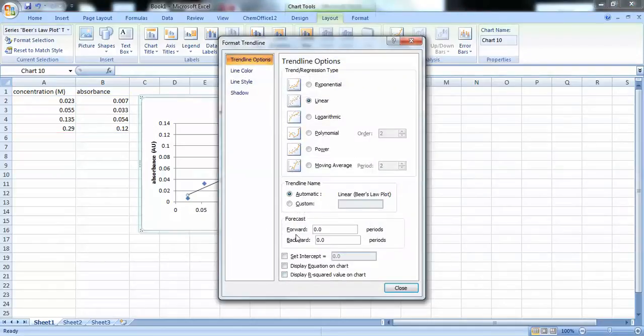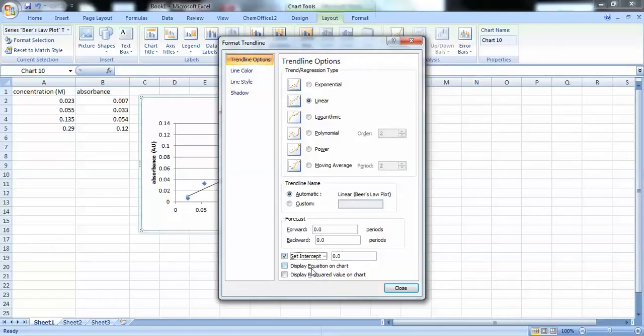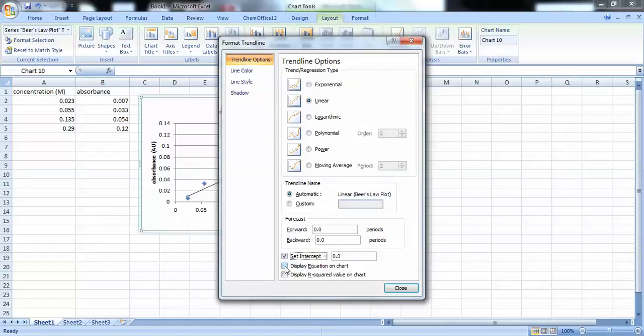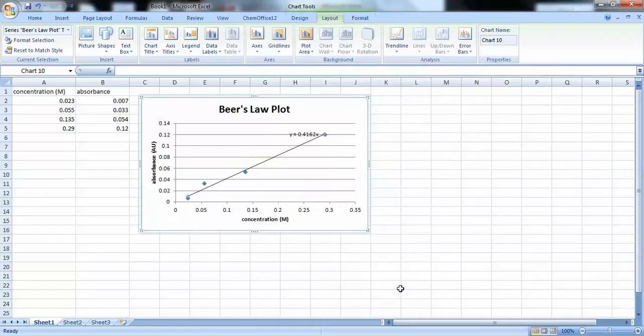And at the very bottom, there are a couple of boxes that we need to check. The first one is set intercept equal to 0.0. And that's because we know that when we have 0 concentration, we should have 0 absorbance. And the second one is display equation on chart. And that will tell us the slope of the line that it drew. So, here it is.